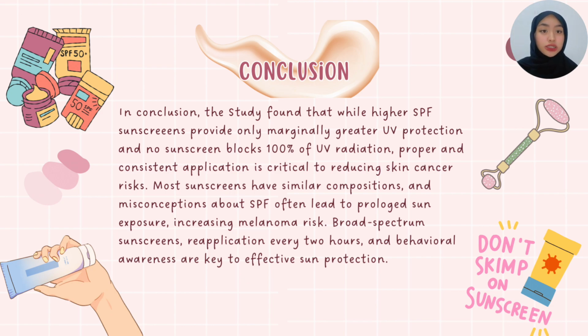Researchers use thin layer chromatography, which is TLC, to study sunscreen ingredients and found most are similar, regardless of SPF or brand. However, sunscreens with zinc oxide and avobenzone behave differently and offer unique benefits. To protect your skin, apply a palm full of sunscreen and reapply every 2 hours, especially after swimming or sweating. And choose broad spectrum sunscreen to protect against both UVA and UVB rays.